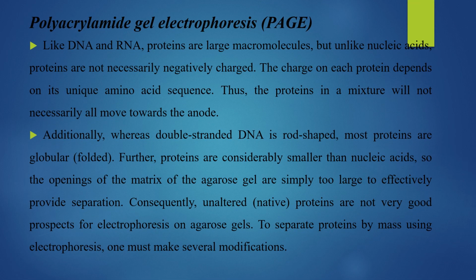Now I move to the next one. Polyacrylamide gel electrophoresis, PAGE. Like DNA and RNA, proteins are large macromolecules. But unlike nucleic acids, proteins are not necessarily negatively charged, but nucleic acids are negatively charged because of the phosphate backbone.